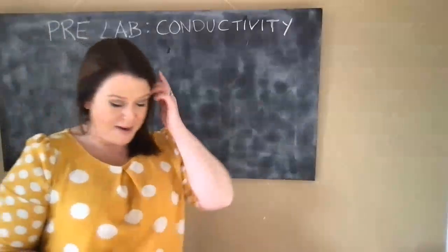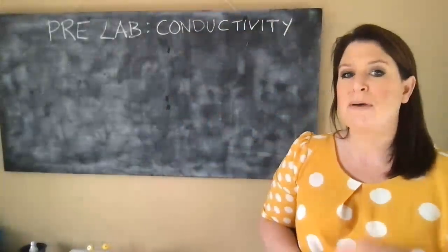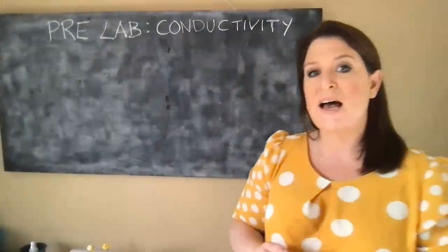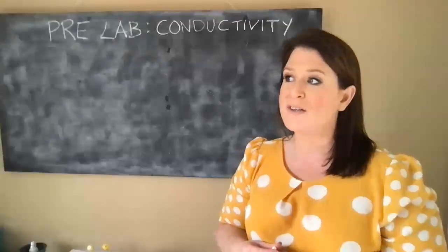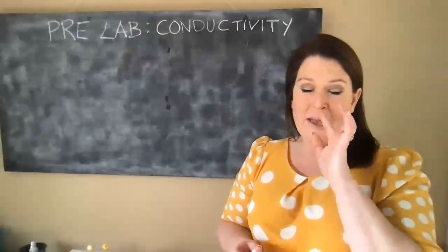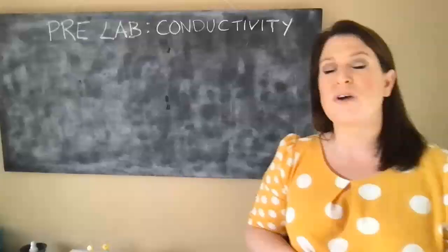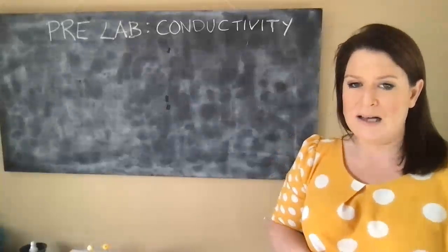Okay, so I'm back, and now I would like to discuss with you part C of the experiment that we're going to carry out today. And part C of the experiment is, as I mentioned, the very first part of this little pre-lab video, that we're going to use conductivity as a tool to allow us to determine the concentration of two separate acids in a mixed acid solution.